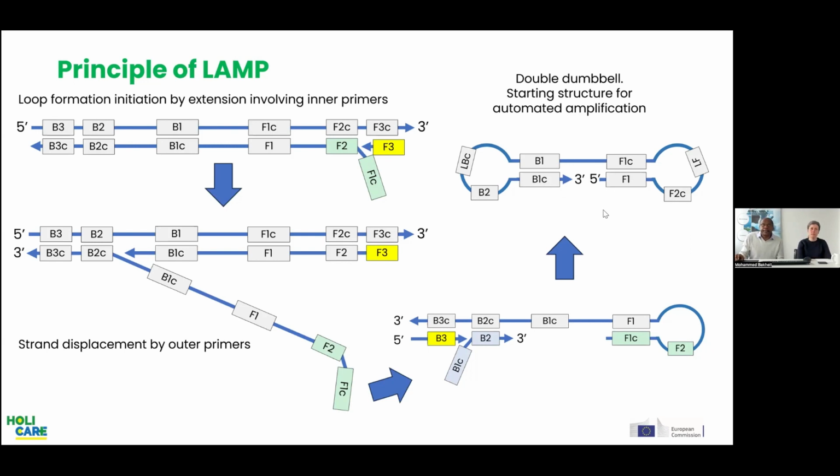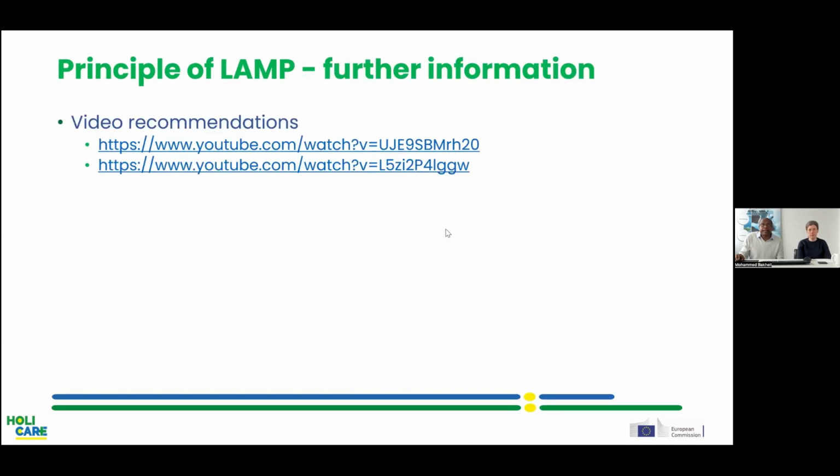So for those who are interested to learn more about the principle of the LAMP, we place these 2 video recommendations. They will also be shared in the publication. And that's actually the short introduction which I wanted to give. Now we forward you to Friederike to continue with the sequence and how we select sequences for the LAMP. Yeah. Thank you, Mohammed.